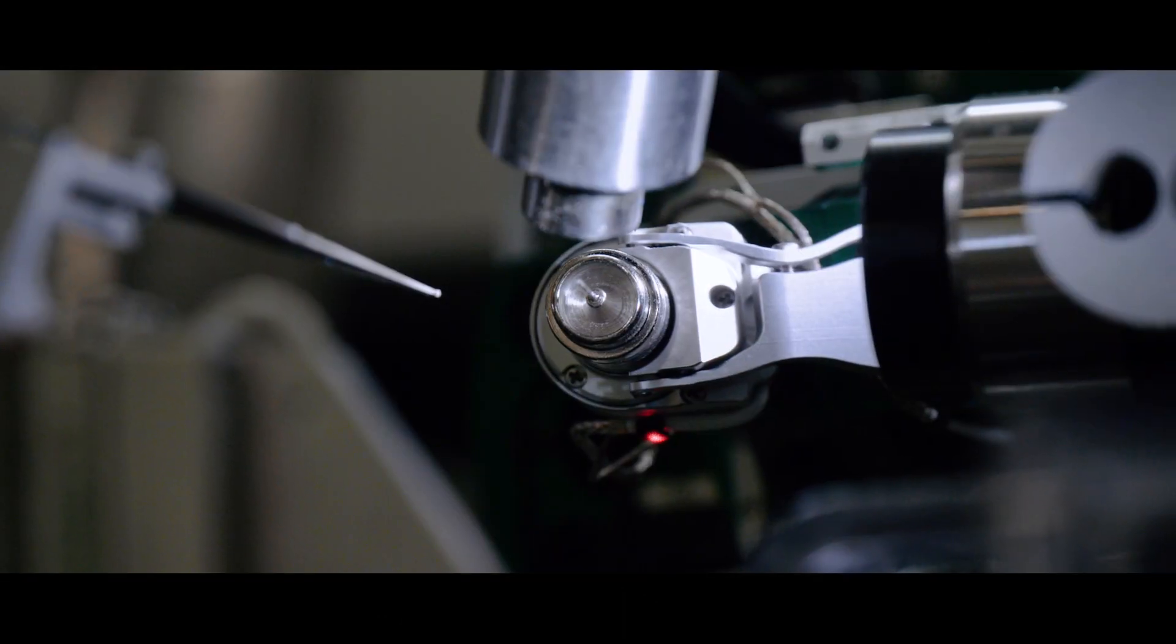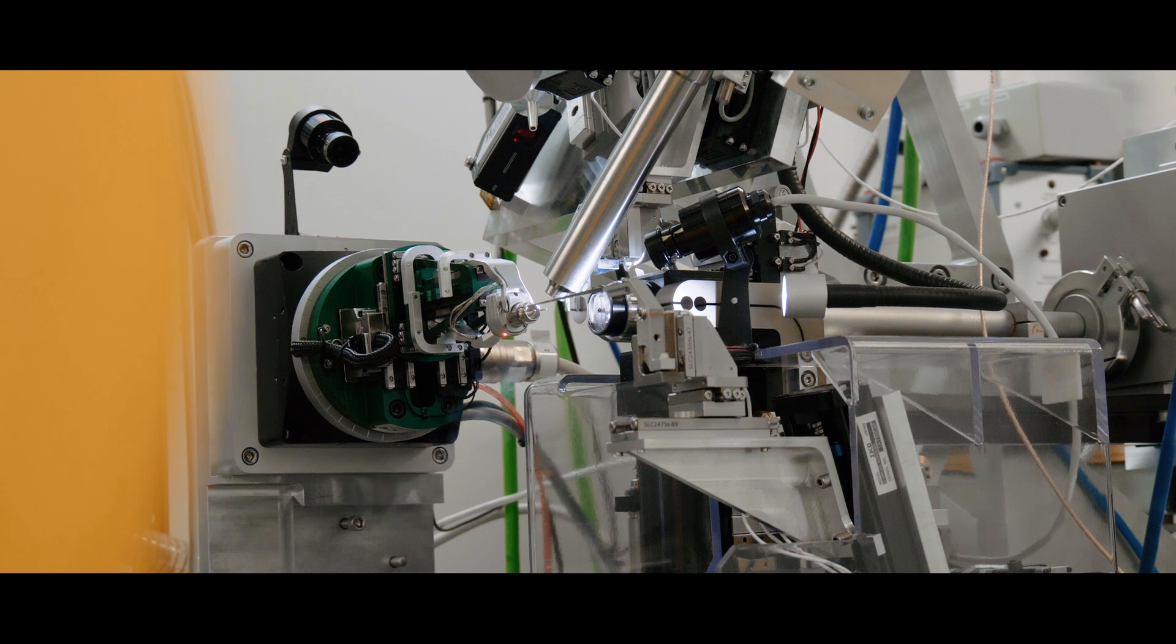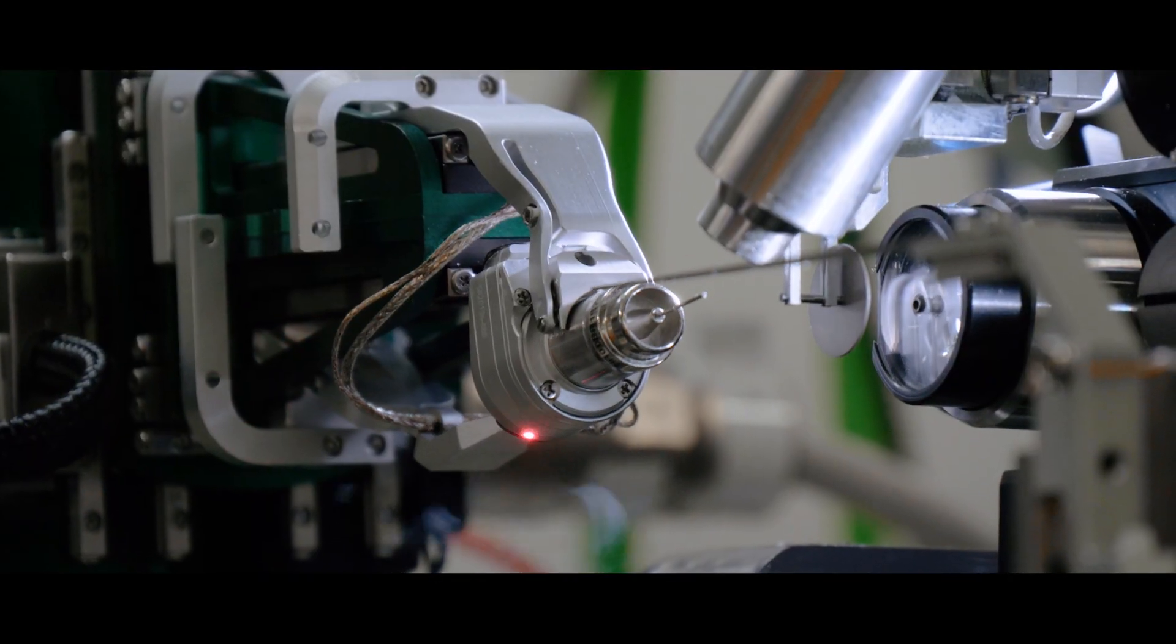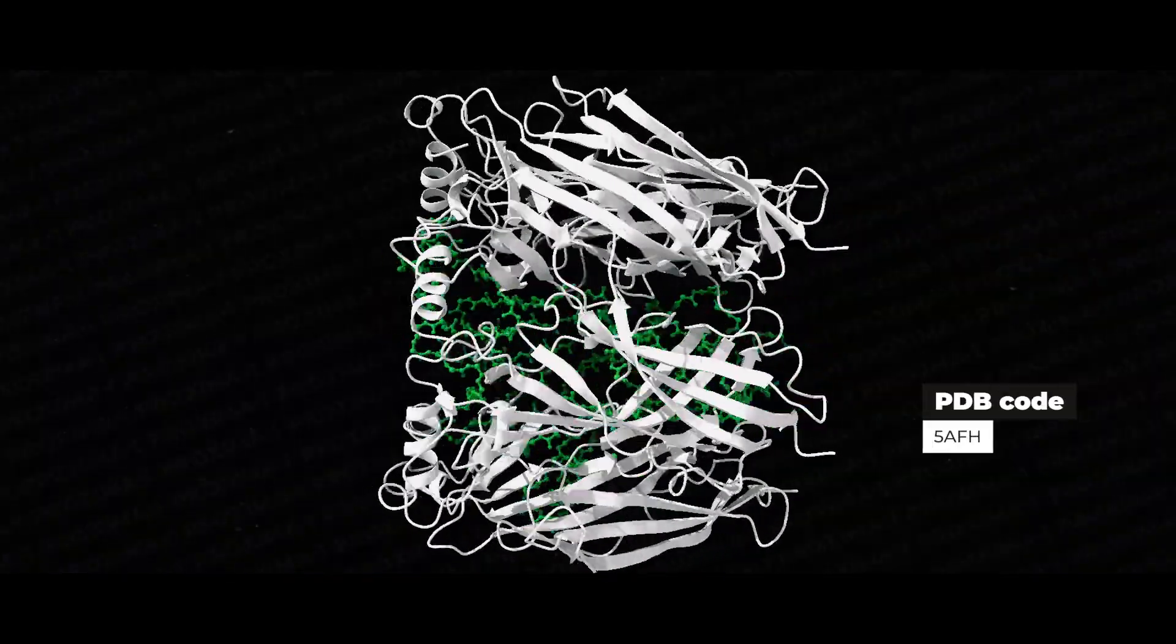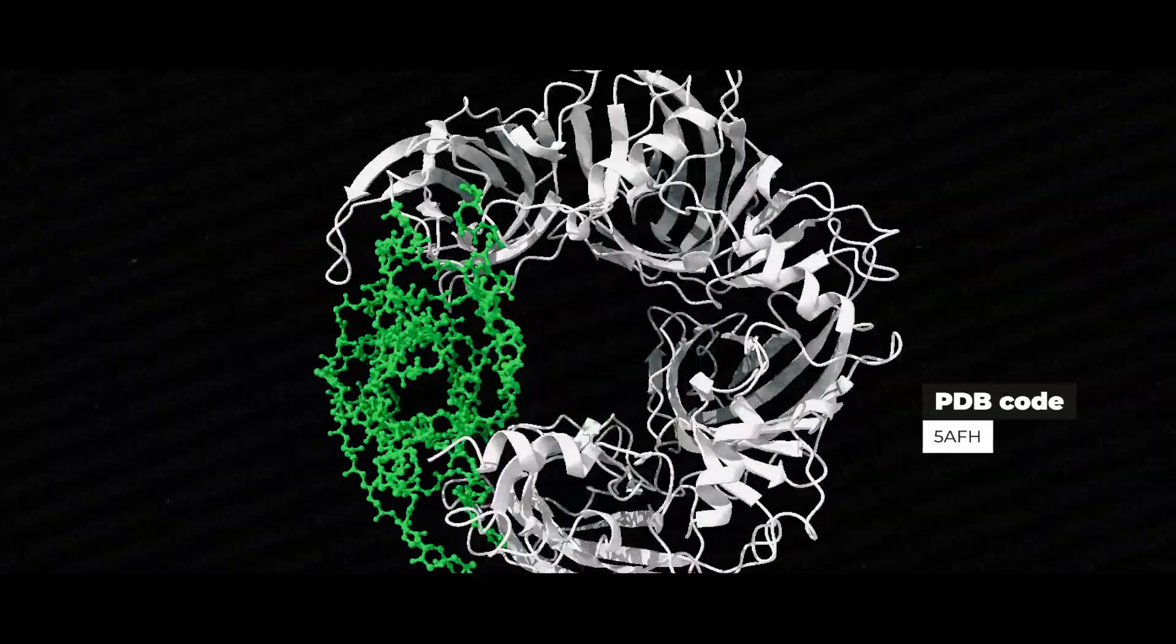X-ray crystallography is a technique which can be used to determine the structure at an atomic scale of molecules. In structural biology it's one of the principal tools used to study the molecules of life, mainly proteins and nucleic acids, in order to understand how they function.